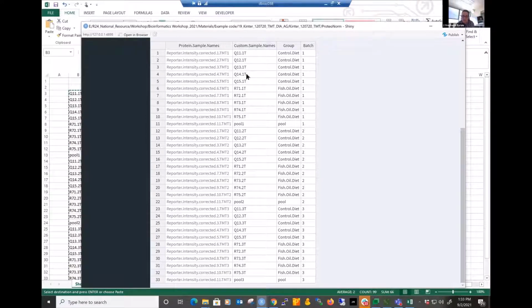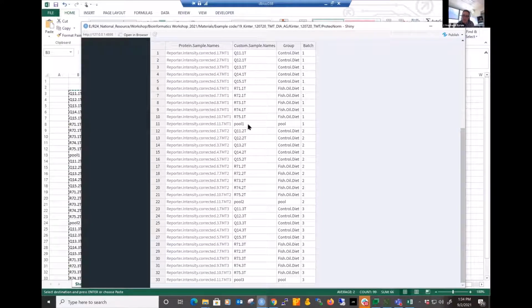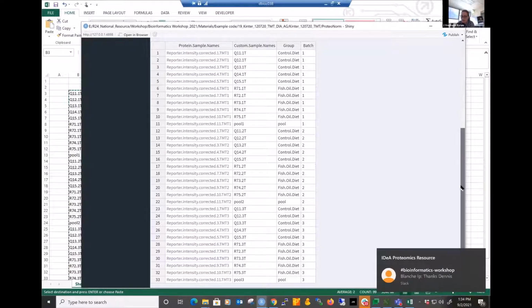So all of these samples are done in triplicate, but across batch in order to really test the batching effect with the same samples. That makes sense. So all those 10 samples are pulled together in TMT1, TMT2, TMT3. Then we also have a pooled sample. The pooled sample is the pool of all of those samples in those different channels. So that's all of our data.